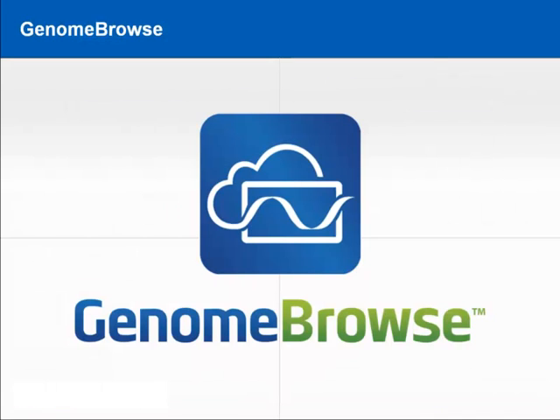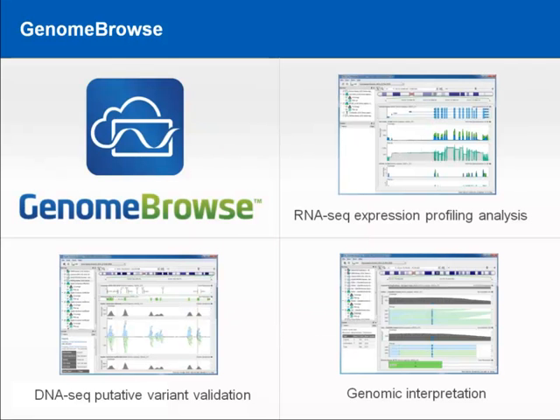The other package we'll be looking at a little bit today is GenomeBrowse. GenomeBrowse is a completely free commercial-grade browser product that we provide. I won't say it's completely feature equivalent to IGV, but it has a lot of the same types of functionality that you would get with IGV, but with, we think, a much friendlier user experience, a more fluid interface, a lot more like Google Maps. That was kind of our target when we started, was to create the Google Earth of genome browsers. And we're still improving it, and we're really excited about it and hope that you find some use there.